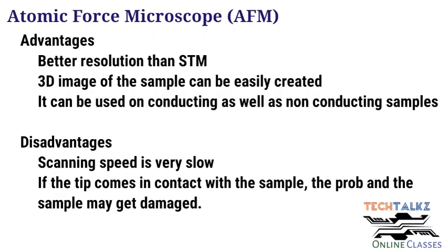Then the disadvantage is the scanning speed is very low. Then if the tip comes in contact with the sample, then that may damage the sample as well as the probe. And this will reduce the resolution of the image.